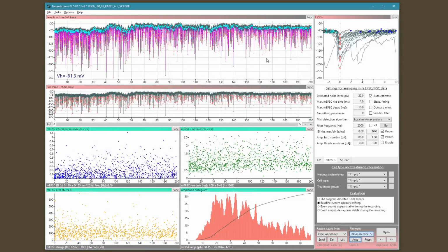I am still developing this program and trying to improve it further. I would appreciate it if potential users contact me and give me feedback on how to make this more stable, robust, and more user-friendly. The strategy is basically that I would like to make this analysis as fast and as convenient as possible.